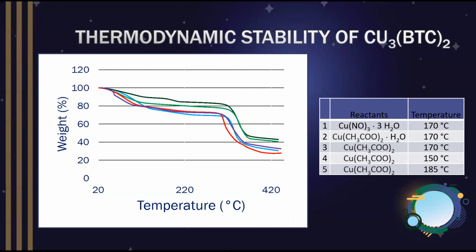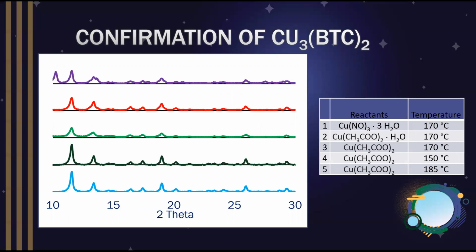Looking at our samples, they all match up except for the first line in the first sample. This is believed to have happened due to water of hydration in the last 4 samples that was not present in the first one. When compared to literature values, the first reaction was very close to what we found copper BTC to be. The following ones were closer to copper BTC monohydrate.